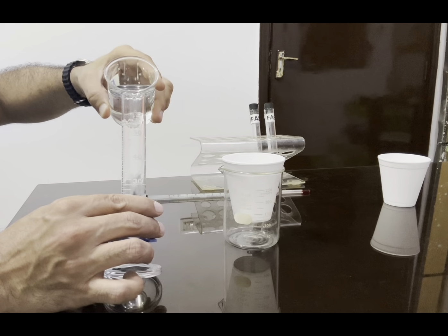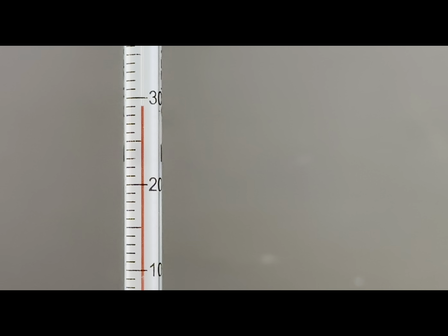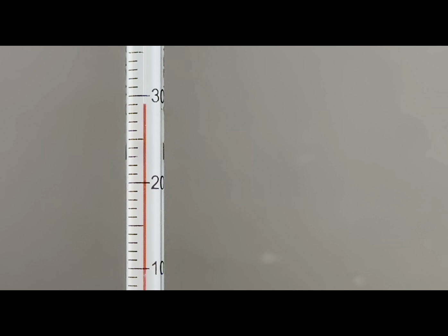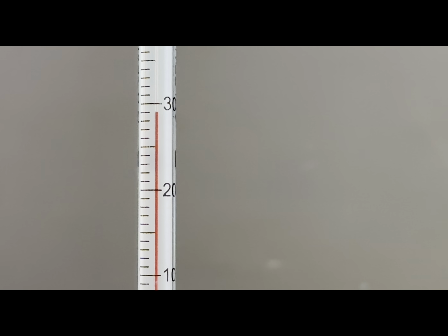Now let's observe the temperature. Before that, let us see the least count of our thermometer is 1 degree Celsius. There are 10 divisions between 20 and 30, so the least count is 1 degree, and the error of this thermometer is 0.5.